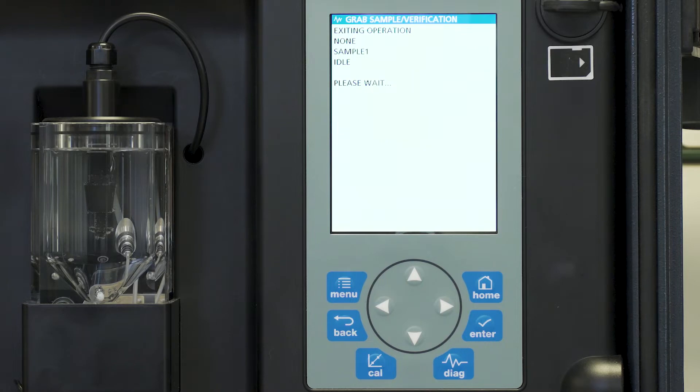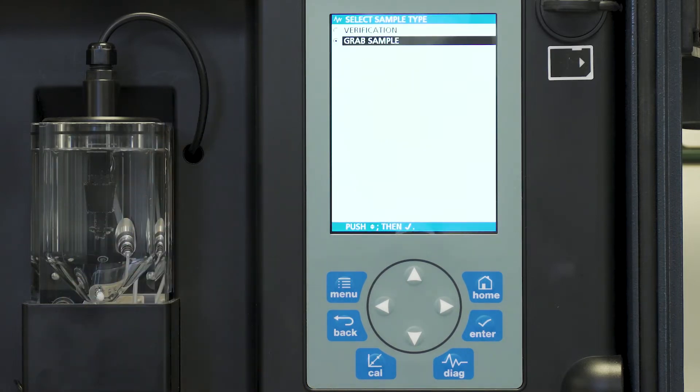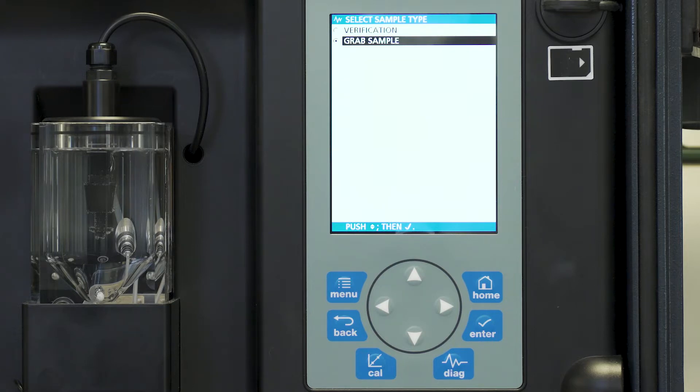It is now exiting the operation. It's asking us if we're going to do a verification with a known standard or grab sample. Today we're going to choose grab sample.